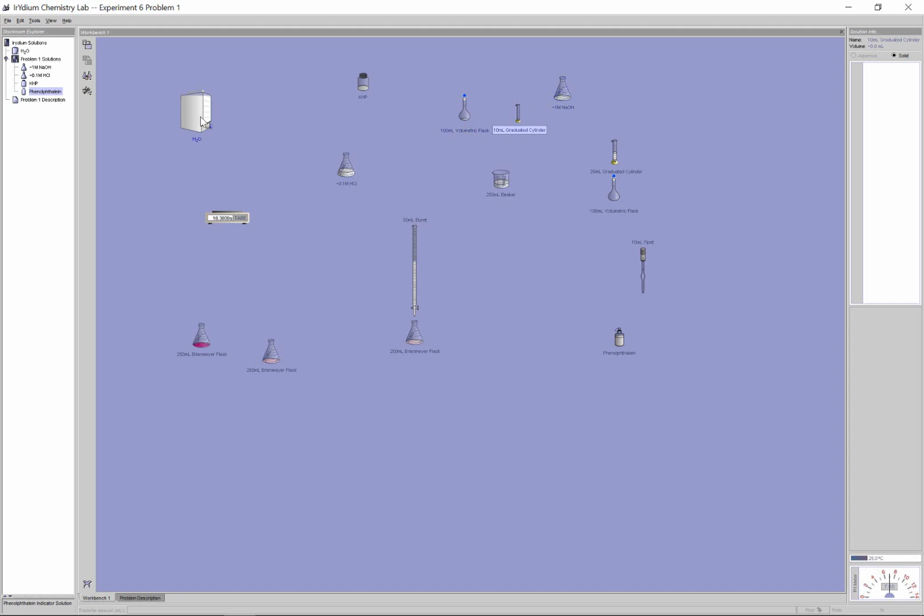And what we're going to do here, probably not using the entire water jug, but maybe putting in a beaker of some sort. But basically, I'm going to add it up to the mark. Because the mark here is going to be at 100, I have about 8 mils. Let's pour in, let's say, 90 mils, right? So that should be about 98 then. So let's pour that in there, right? And there we go. We're pretty close to the mark.